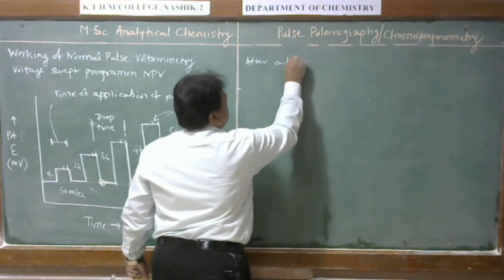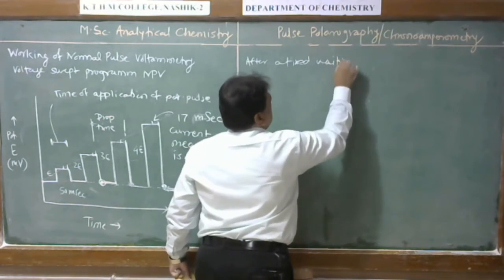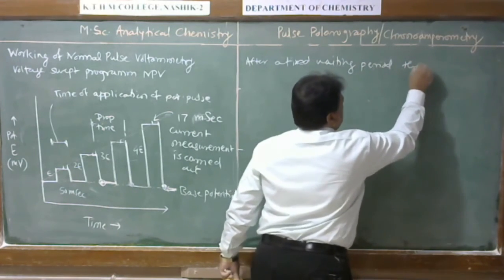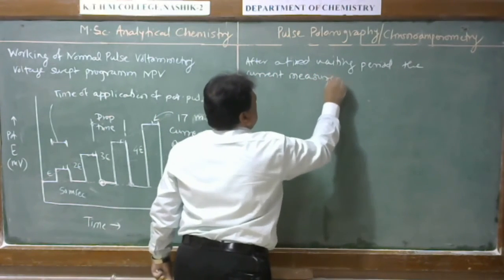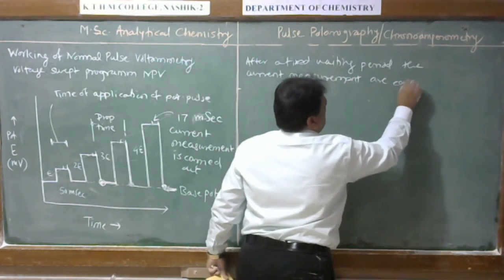After a fixed waiting period, the current measurements are carried out.